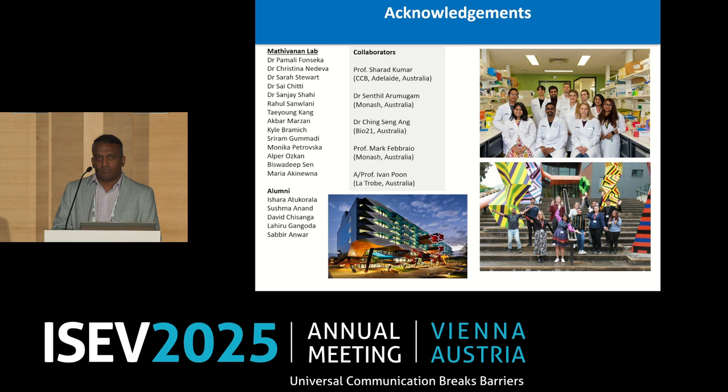Thank you for the talk. I had a question regarding the slide where you showed that when you get proteomics from the cells, you find 3,000 to 4,000 proteins in mass spec, but when you do EVs, you find 2,000 or less. Is it something to do with the methodology itself, or is it generally that in EVs we will find fewer proteins? Because it's ultimately not a cell, right? You are only localizing certain proteins. So what do you think about that?